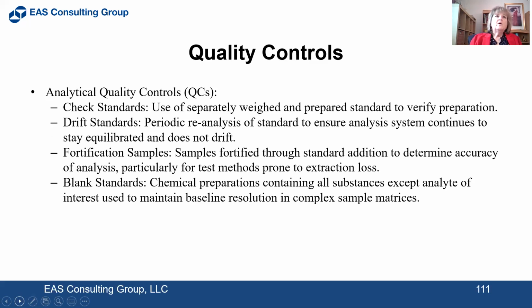So, analytical quality controls. There are check standards, which use a separately weighed and prepared standard to verify your preparation. Drift standards, which are a periodic reanalysis of a standard to ensure the analysis system continues to stay equilibrated and does not drift. That's a drift standard that is injected from the beginning of the run all the way through to the end.